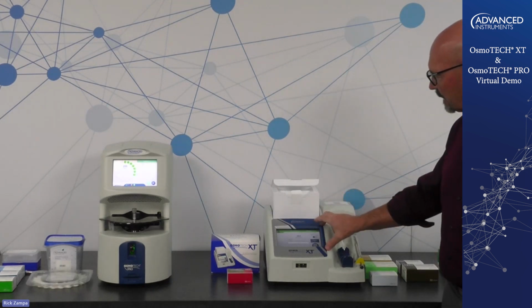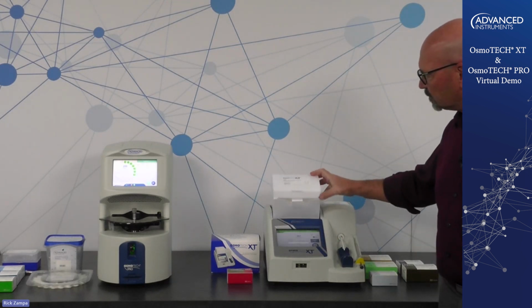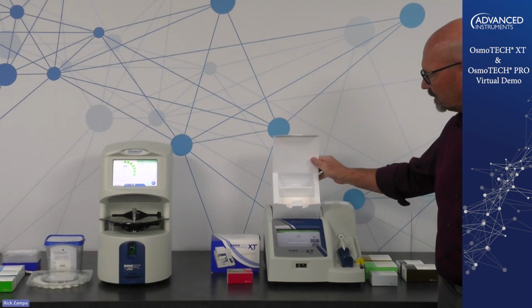You have your obvious touchscreen display on the top. Your consumables box sits up here at the top with your sample tips and your chamber cleaners.